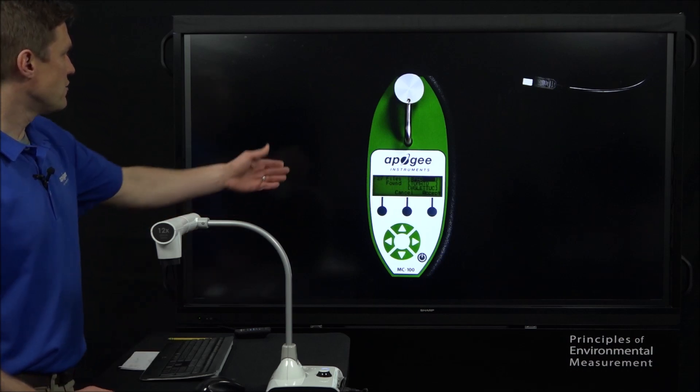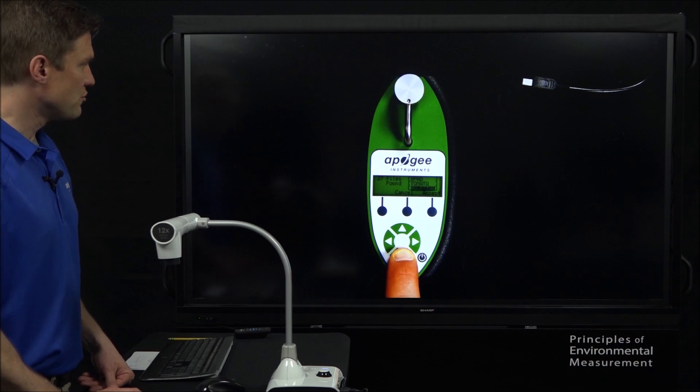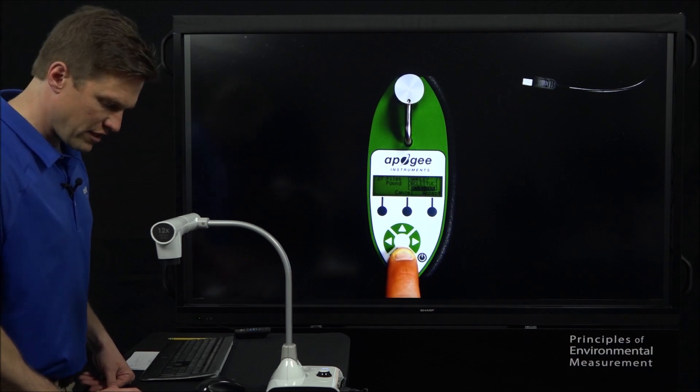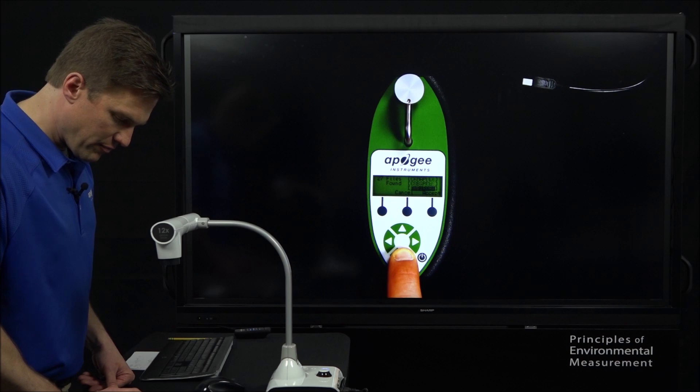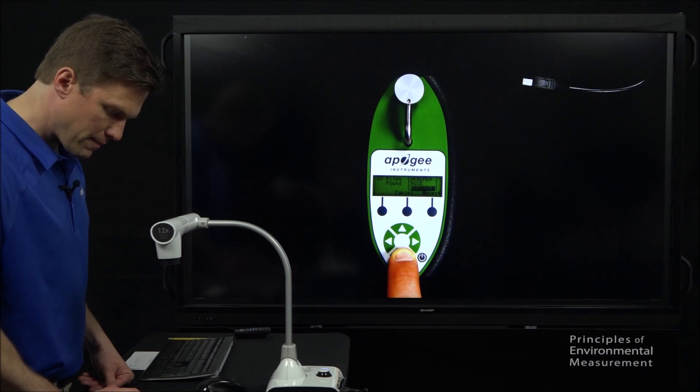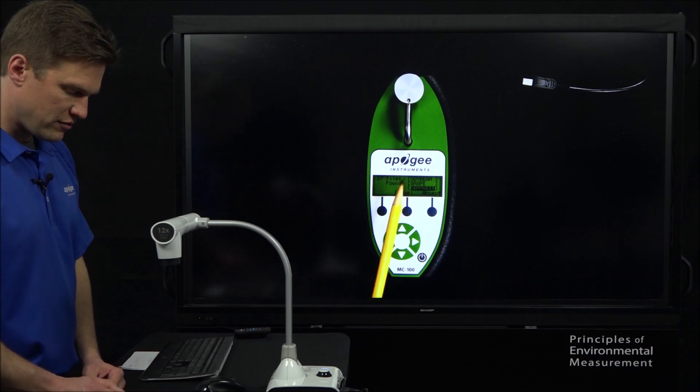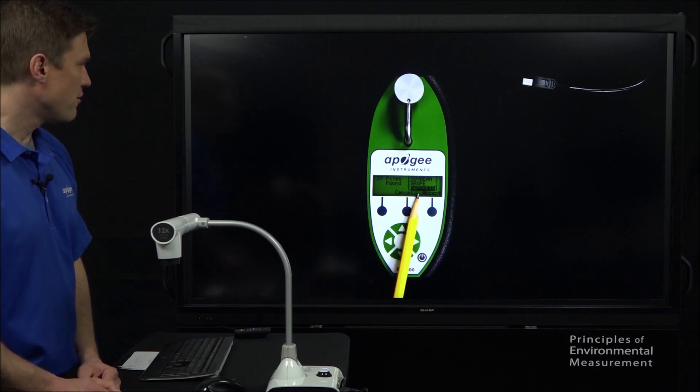Now we've got 27 files with different coefficients for a different species. And we just scroll through until we find, let's look for cannabis. It may be down at the bottom or maybe it's in the middle of the list somewhere. There's cannabis, down at the bottom. So, the last two here. We have grape and we have cannabis.